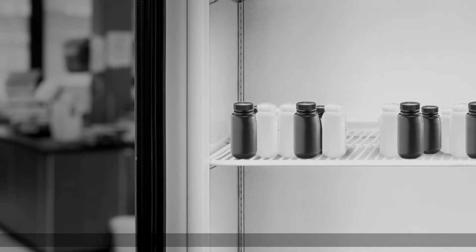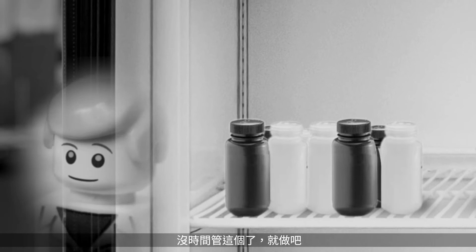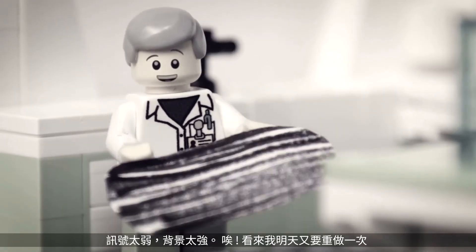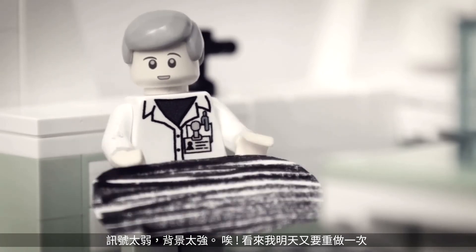Now it's time to detect your signal. How old is this ECL? Too late to figure that out. Signal to noise is too low. I guess I'll repeat this tomorrow, if I have more sample left.